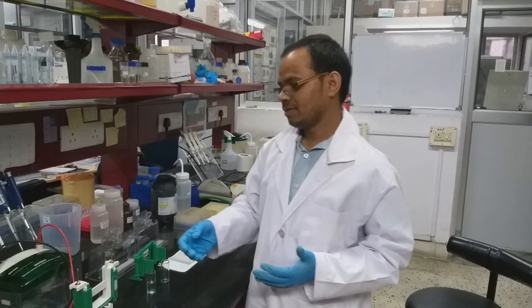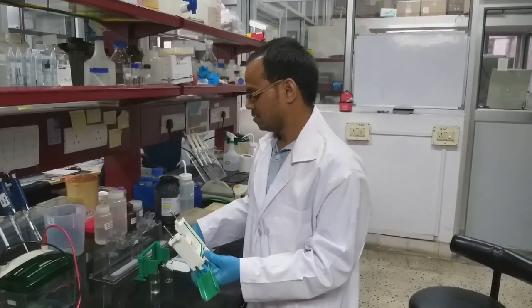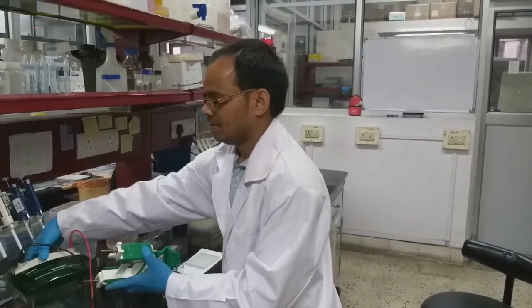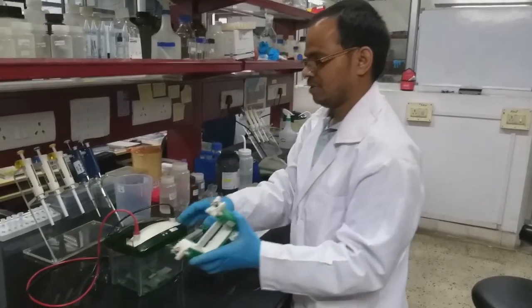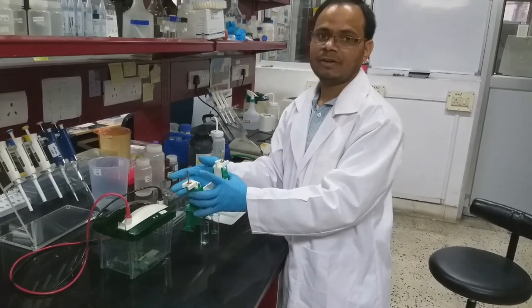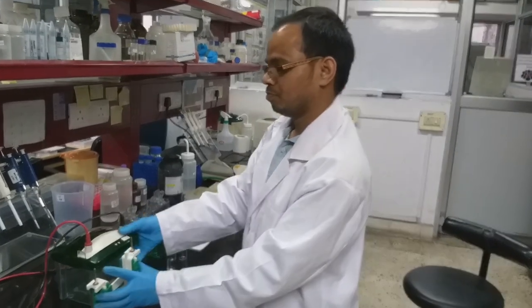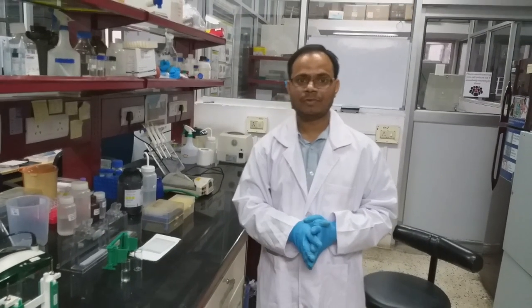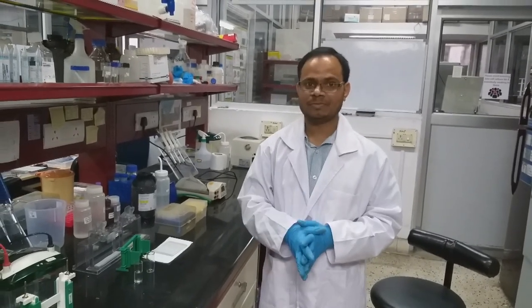After that, we will fix this gel into this one. We will keep this reservoir. Then we will connect to the power pack and run the gel. So this is the overall introduction of how to prepare an SDS based gel.